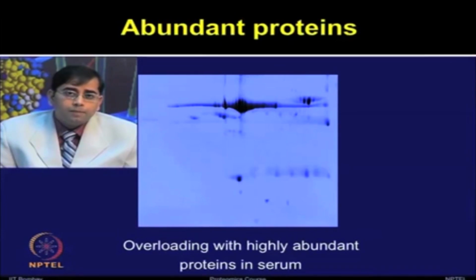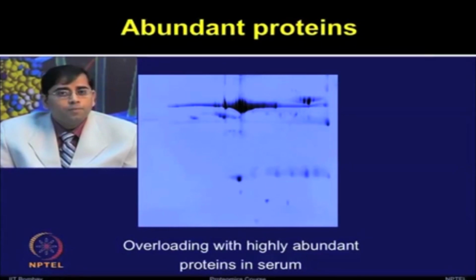In plants, one can expect RuBisCO as one of the very large proteins present in the plant leaves. These abundant proteins mask many smaller proteins and create problems in two dimensional electrophoresis, because of the IEF process, and when you stain the gel, you can see different types of streaking, as well as the whole region masked because of the abundance of that protein.